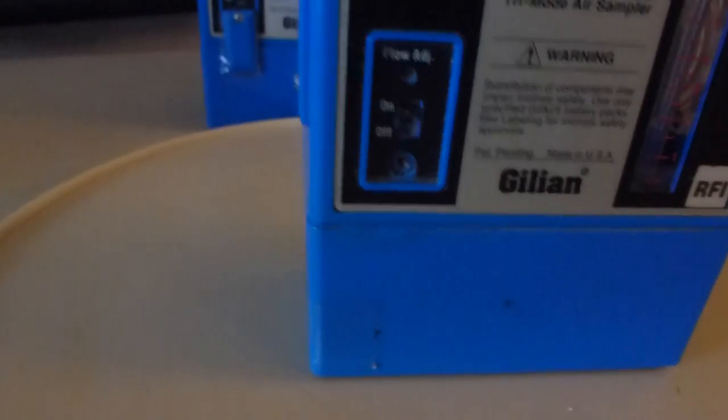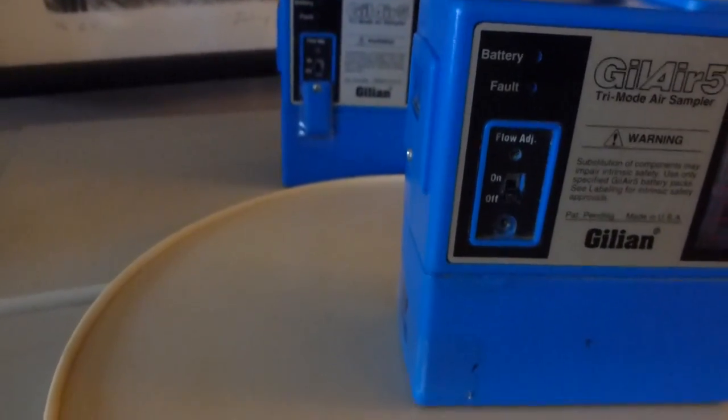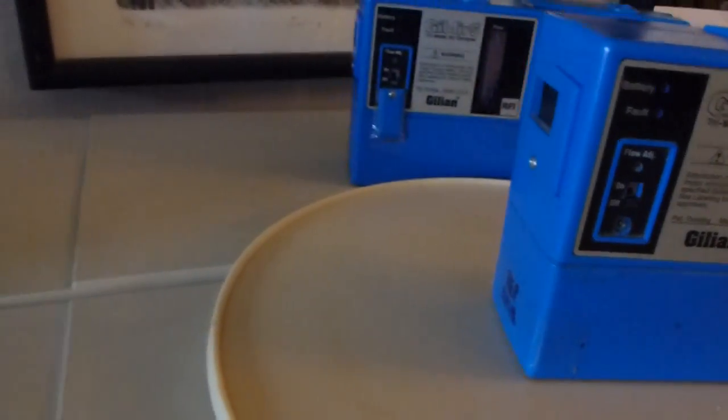So this includes 3 Gilair 5 tri-mode air samplers, plus the case, plus the vials. Also are 6 to 8 of these small tubings.